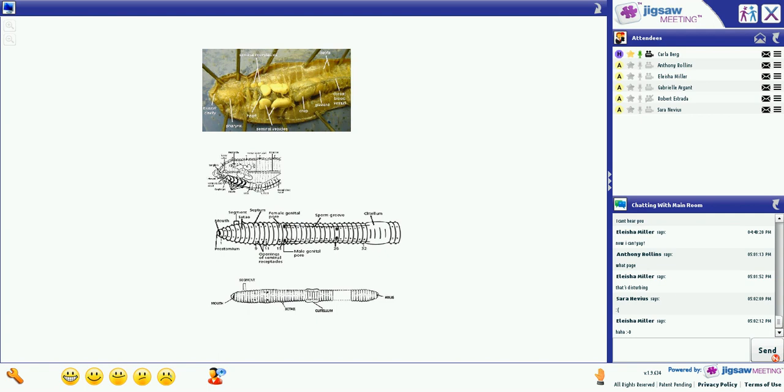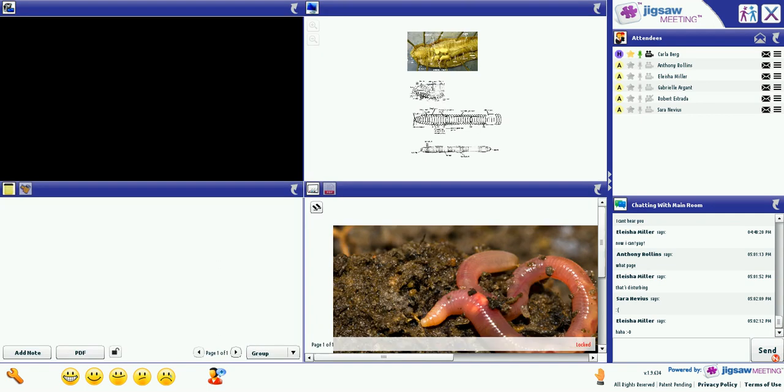Then around your esophagus, you should see what looks like little brown horseshoes or black horseshoes. If you see those, go ahead and give me a smile. This is not something we're going to label, but if you see the little black arches, go ahead and give me a smile. Some worms, they're very easy to see. Some, they are not. It all depends on your worm. I can actually see mine fairly well.